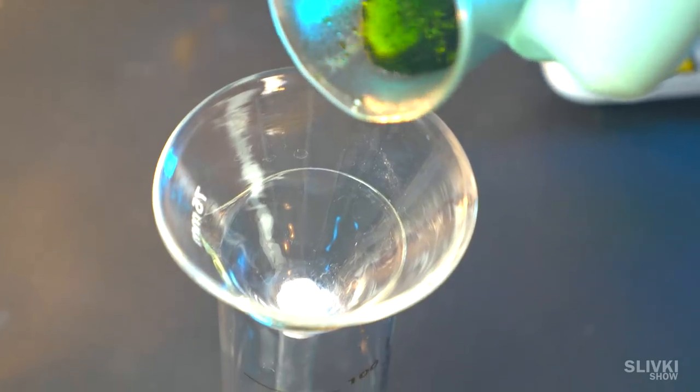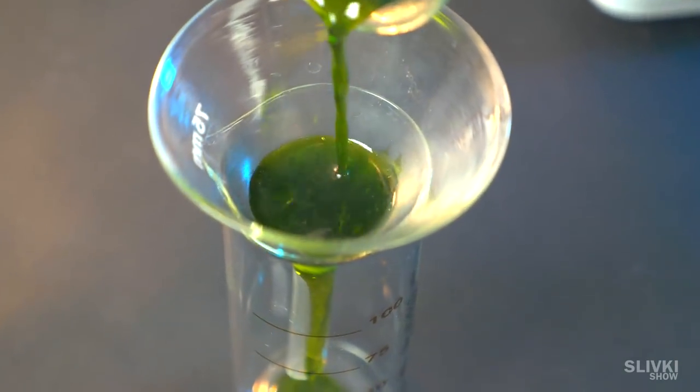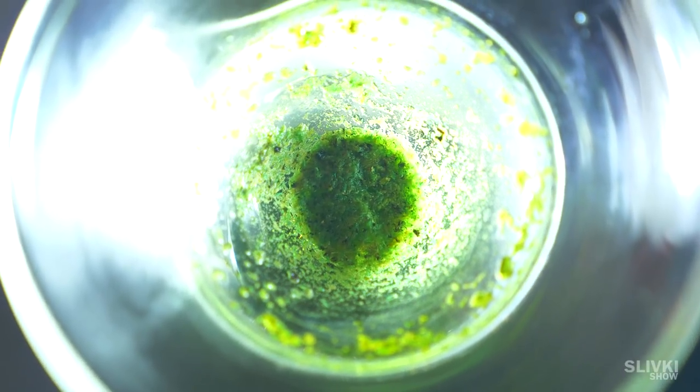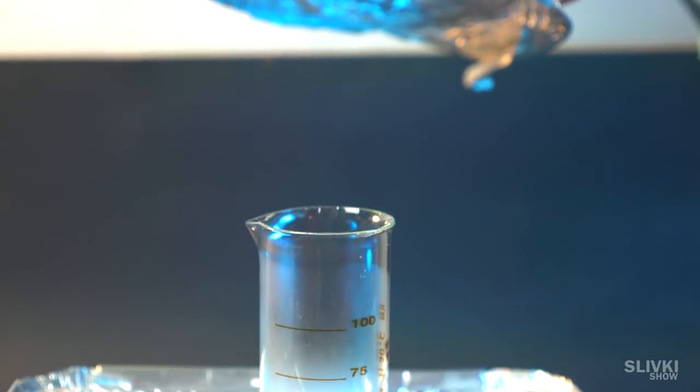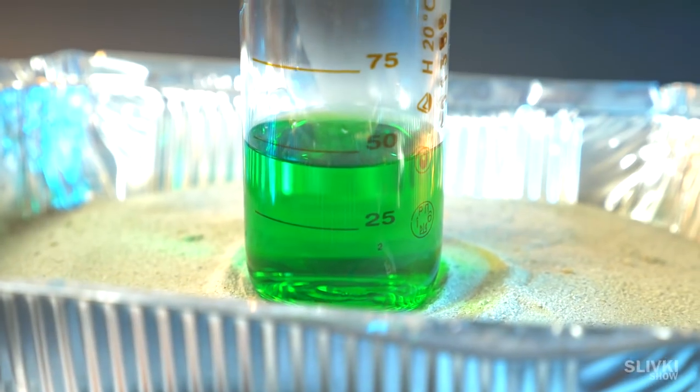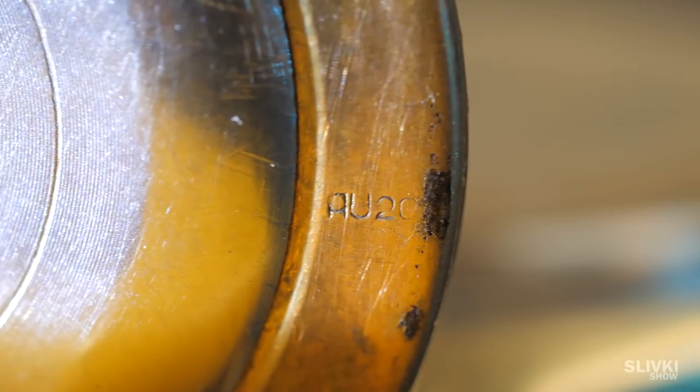In the end, filter all of this through with a funnel and cotton filter. All excess left on the cotton. Add distilled water to mixture and evaporate twice, like we did in the previous episode with watches.